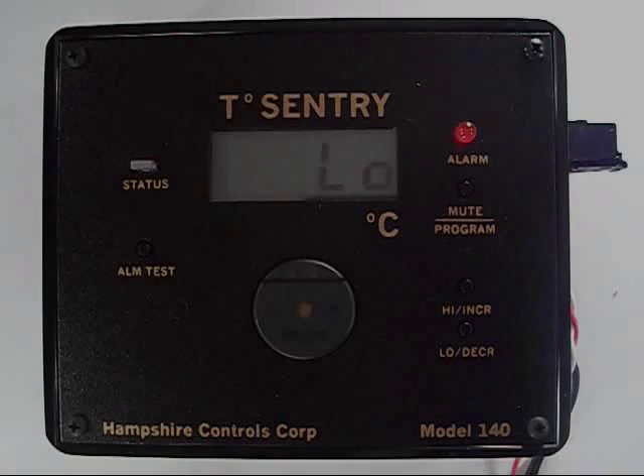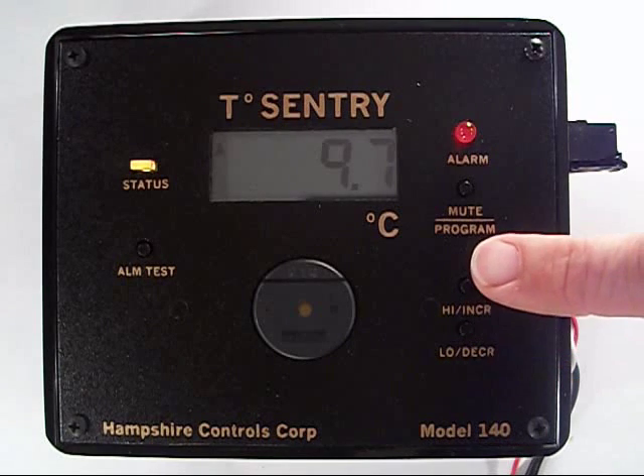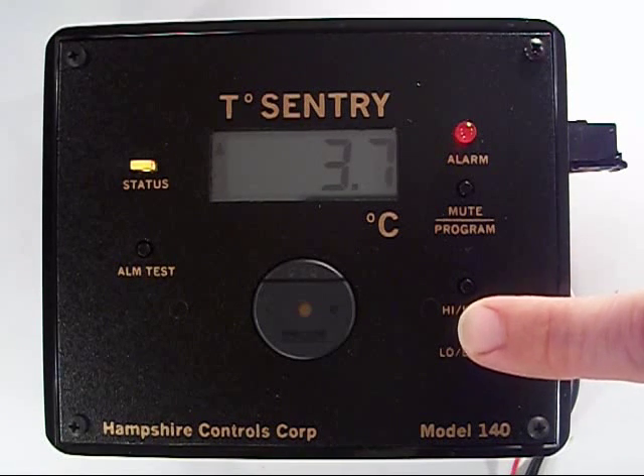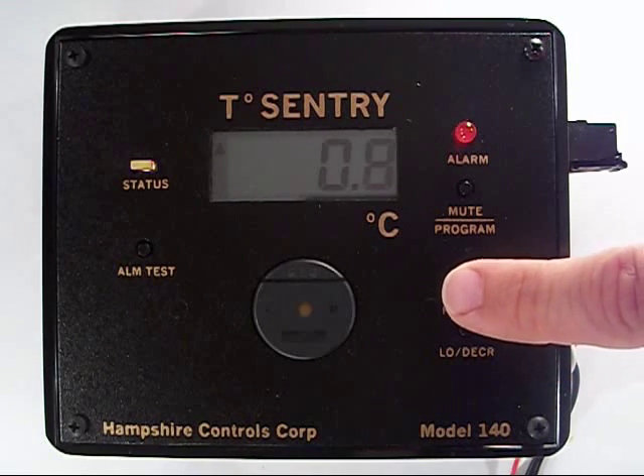Low temperature. Now hit the program button until you see LO for low. Increase or decrease until you have your low temperature setting. I'm setting this for 1 degree centigrade. When the probe hits 1 or below, the alarm mode starts after my initial alarm delay.